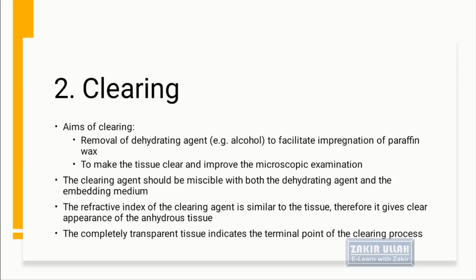It is important that the refractive index of the clearing agent is similar to the tissue, because it gives a clear appearance of the anhydrous tissue. A completely transparent tissue indicates that the tissue has been cleared of the alcohol.